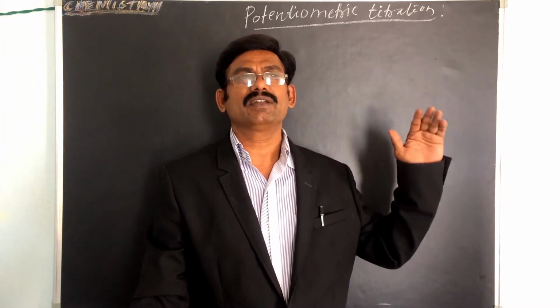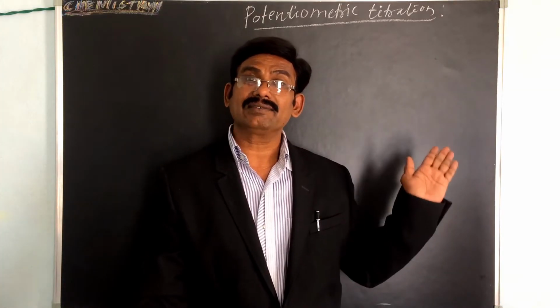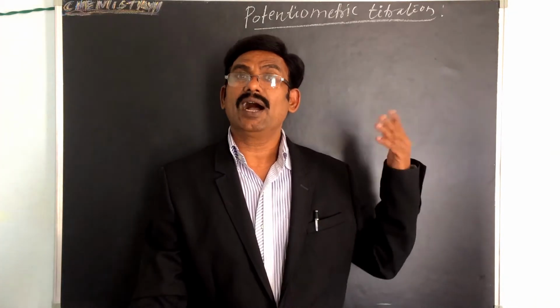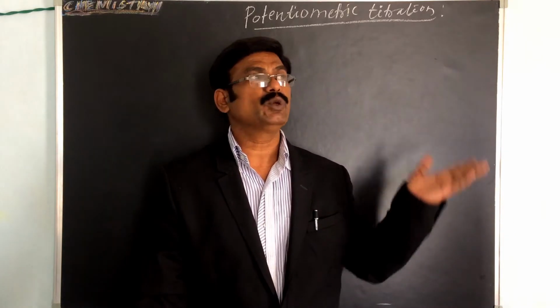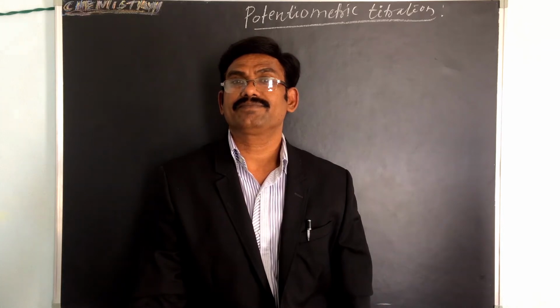The previous topics are what? The electrochemical series and electrodes, especially the glass electrode, calomel electrode and hydrogen electrode. These are very useful in potentiometric titrations.